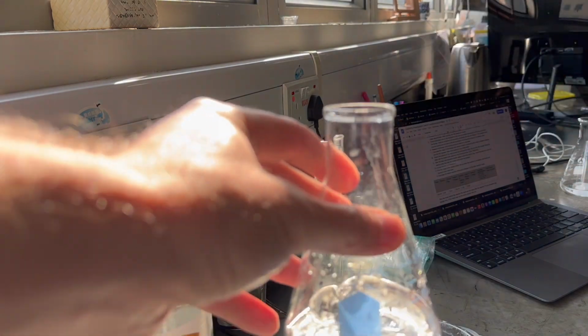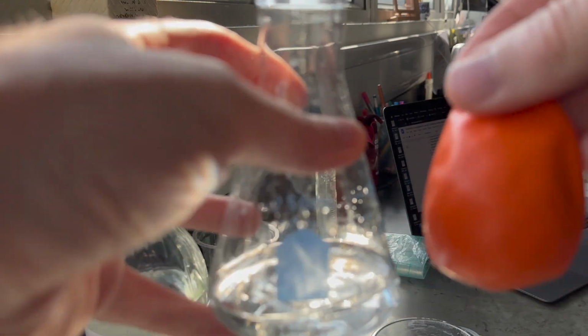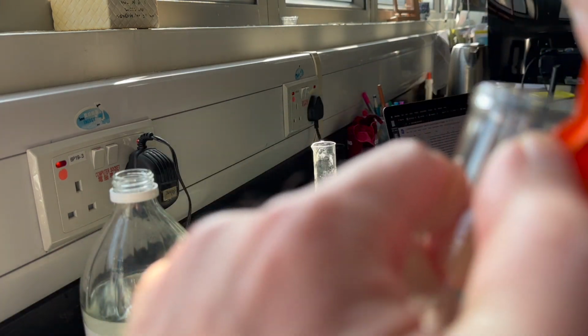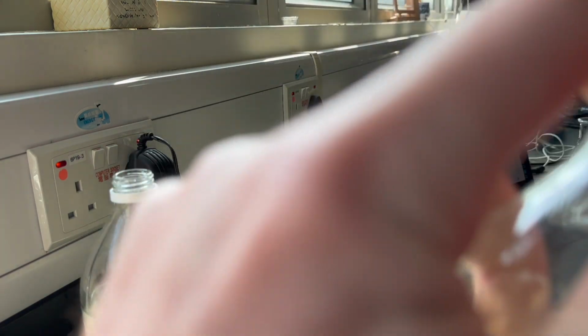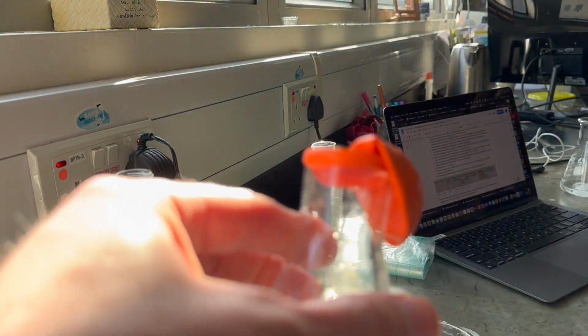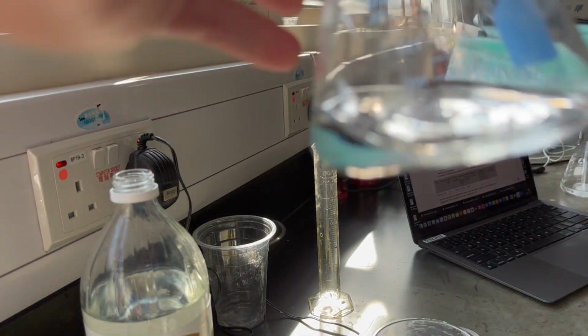Okay, so here's my flask and here's my balloon. Now I have to do this so no baking soda falls into the vinegar, because I don't want to start the reaction until everything is completely closed. Okay, I'm pretty happy with that. No reaction yet, so let's put it in the Ziploc bag.